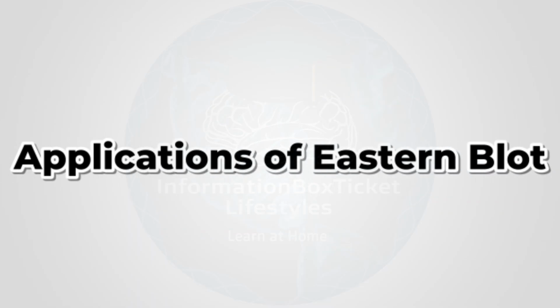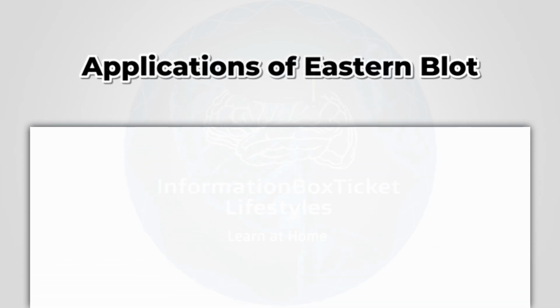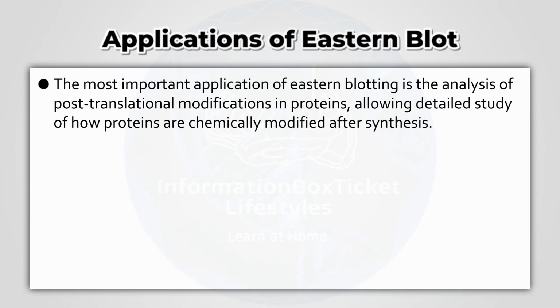Applications of Eastern blot. The most important application of Eastern blotting is the analysis of post-translational modifications in proteins, allowing detailed study of how proteins are chemically modified after synthesis.